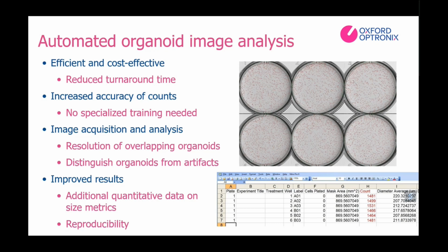This ability to measure the effects of therapeutic regimes beyond absolute organoid number, but also organoid size, makes it possible for research labs to extend the sensitivity of the organoid forming assay and allows researchers to obtain previously unquantifiable information related to organoid growth dynamics. Finally, one last major advantage of these automated systems is that entire experiments can become fully automated and reproducible under the exact same settings, regardless of whom the user is.